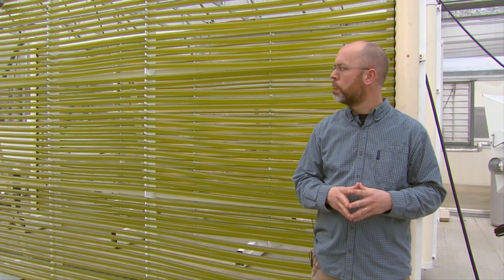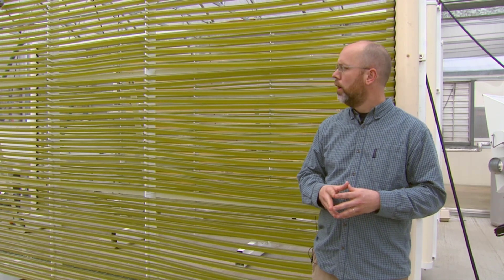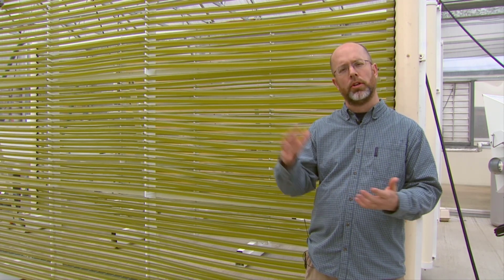You can see we have this housed out in a greenhouse where it gets plenty of light. The cool thing about these systems is it's a semi-continuous harvest system, so you can add new media to the system and harvest algae from it without opening it to the environment. It continues to stay in that uni-algal culture environment, but you can still harvest.